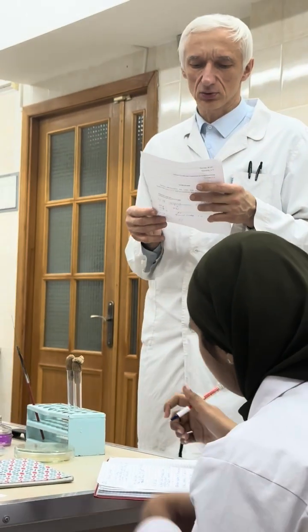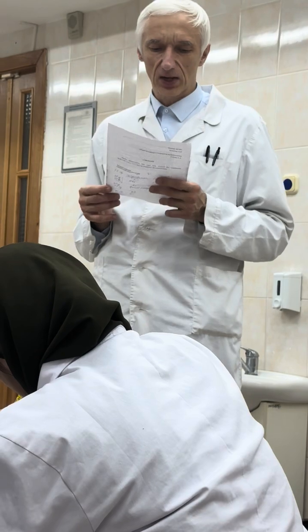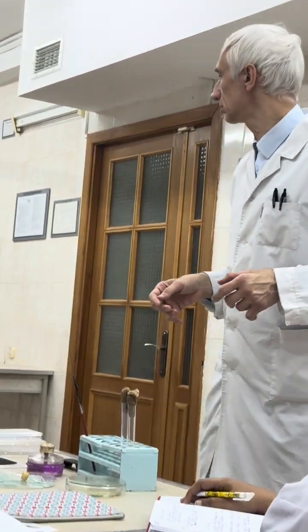Here it is, the first block. The second block is associated with inoculations, from 4 to 7. Excuse me, doctor. When doing the slides, do we need to do the staining? Sorry, forgot. My fault. So people, no, anyway, I need this one.